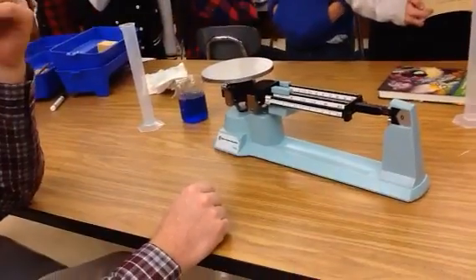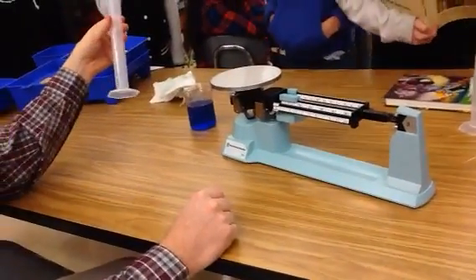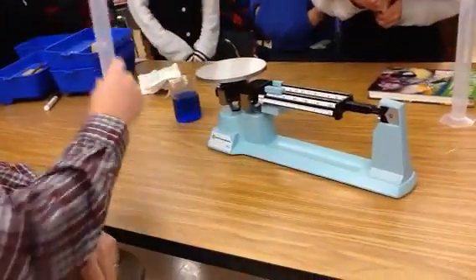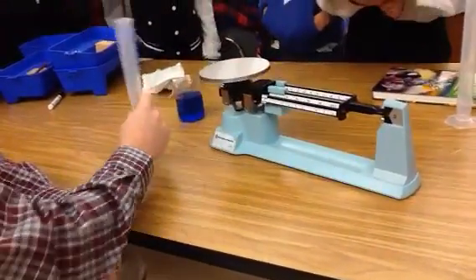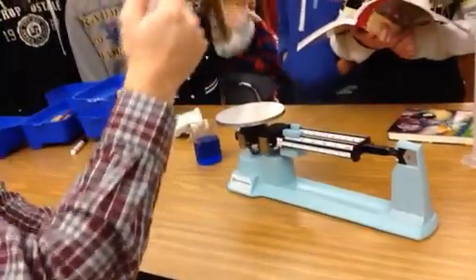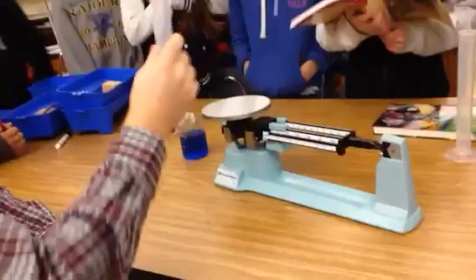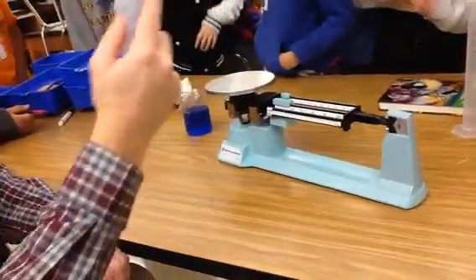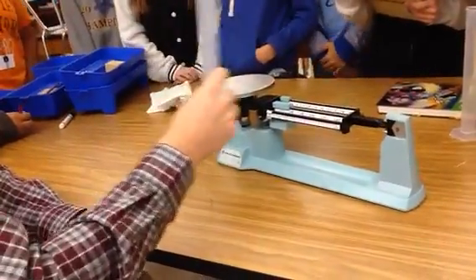Thankfully there is a solution. All you need to do is take the graduated cylinder and it's going to hold the water for us. But we can't put the water in first because then that will give us the mass of the water and the cylinder. So we have to get the mass of this first, and what you're going to end up doing is subtracting the empty cylinder from your mass each time.